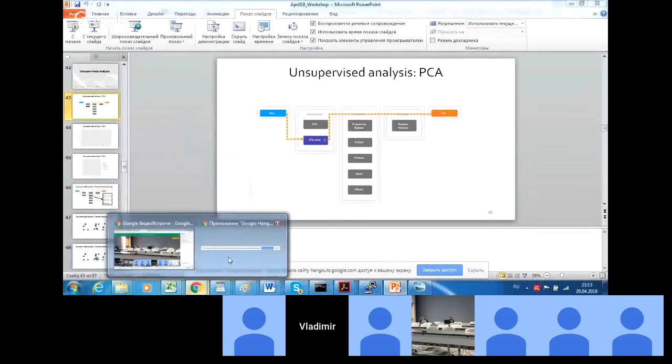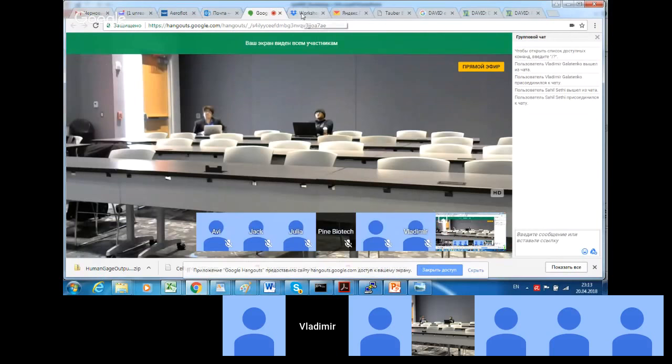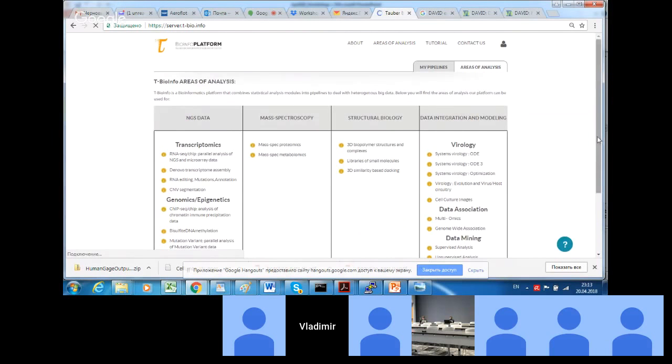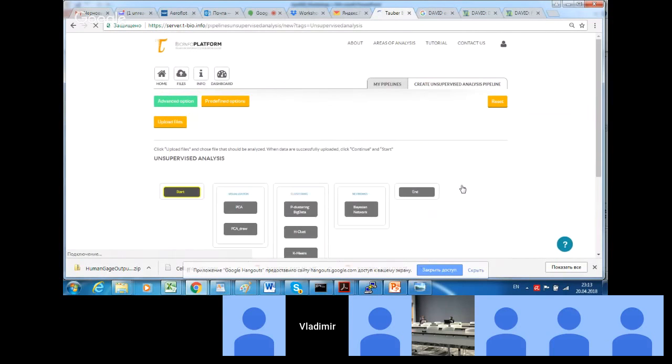In order to see the result of this projection, let us create one more very simple pipeline. So let us go to the areas of analysis. Unsupervised analysis.